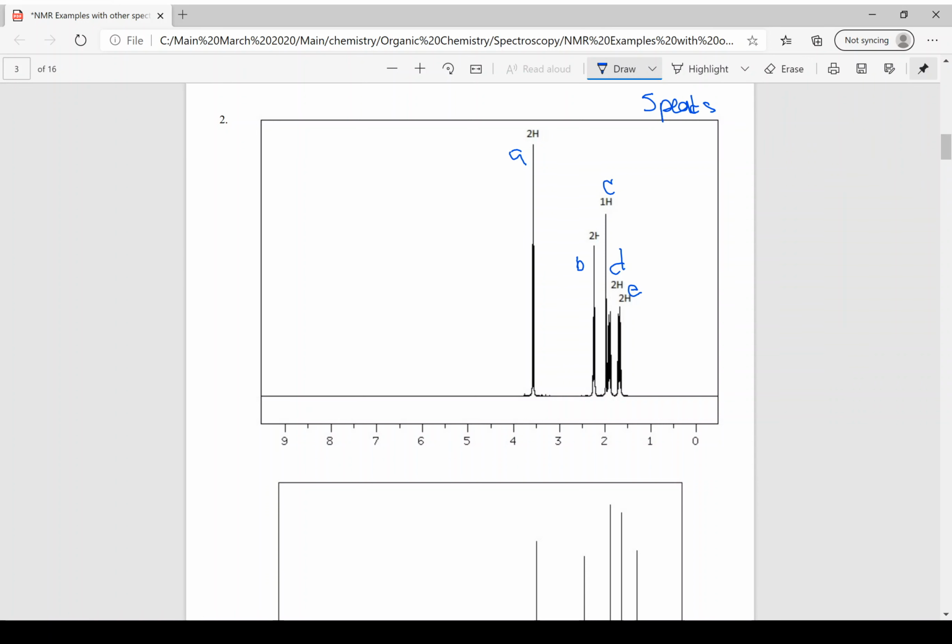I'm going to add up my hydrogens, so 1, 2, 3, 4, 5, 6, 7, 8, 9. All right, it's odd, so I know there has to be a nitrogen or a halogen. If you go back to your units of unsaturation, remember hydrogens always come in evens. The only time you wouldn't is for nitrogen or if one's been replaced with a halogen. So I know something important, and that automatically pulls my eyes right here. 3.5, that is the perfect location to be connected to somebody electronegative.